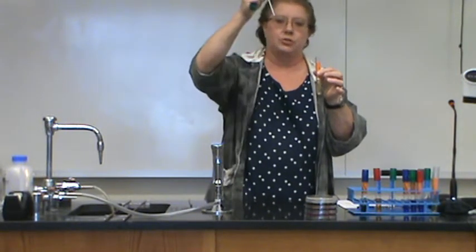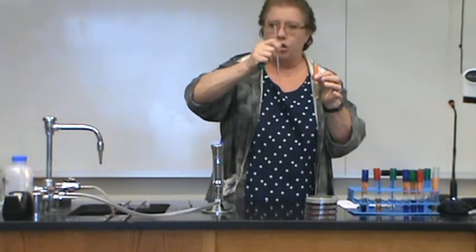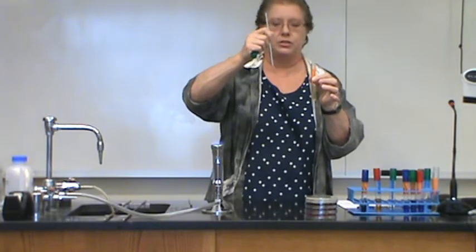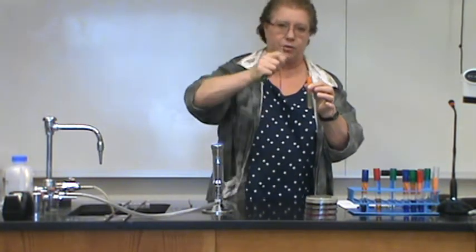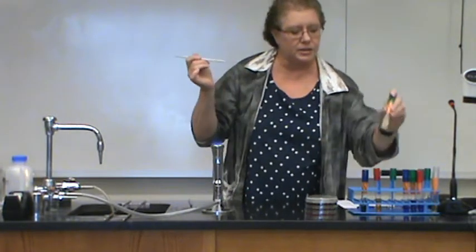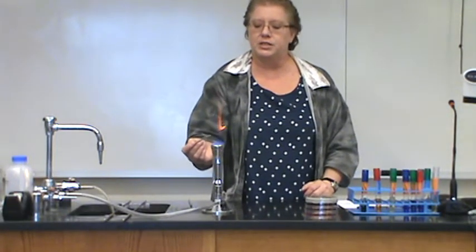What you want to do is get it all the way through the media so that you can get an anaerobic reaction, and so that you have a clear positive or negative result. So you use the stab technique, stab it right down into that media, flame the top, put the lid on, so now your SIM tube is inoculated. Remember, this needle has bacteria on it, and it needs to be sterilized.